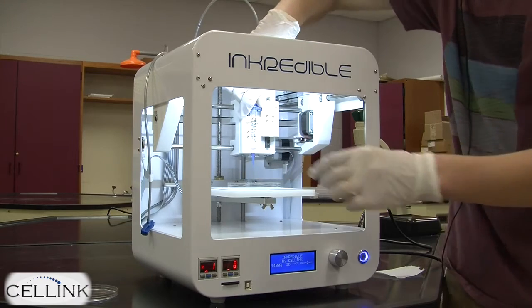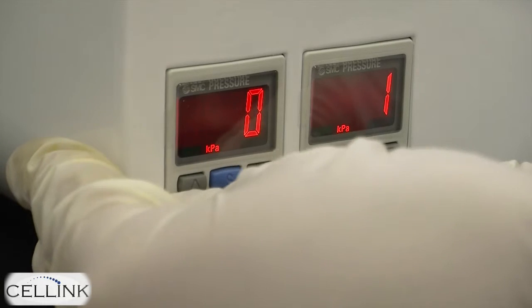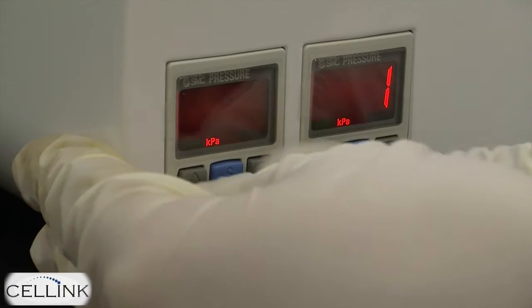Once this is finished, before you plug in the air compressor, make sure you go to the lower left corner of the bioprinter and zero the pressure to each print head.